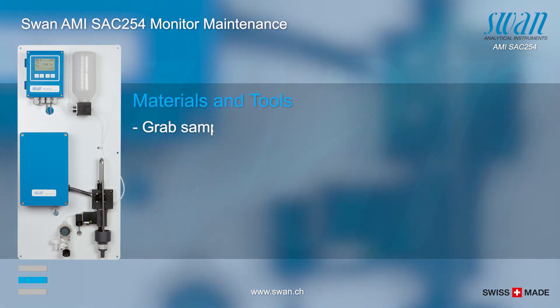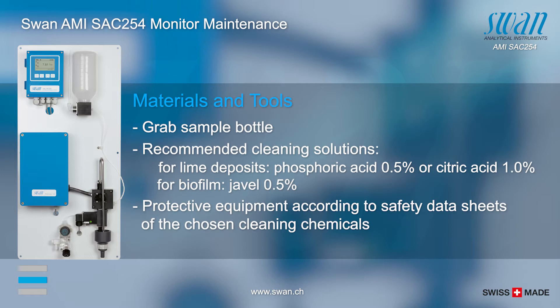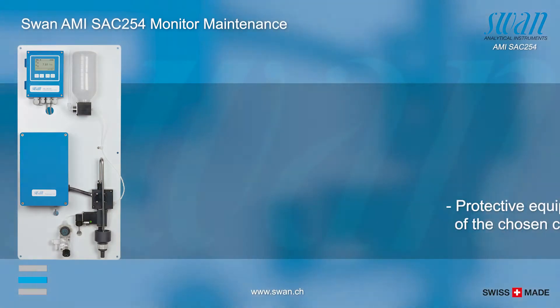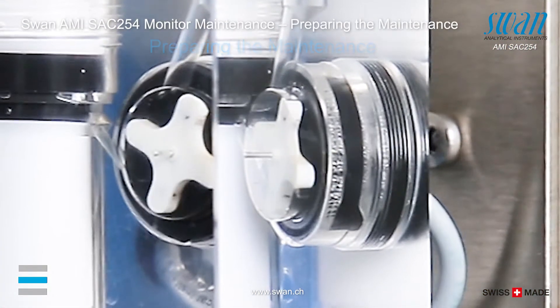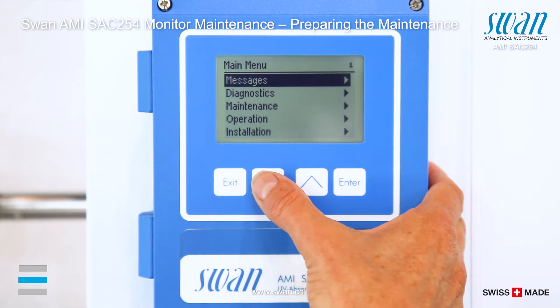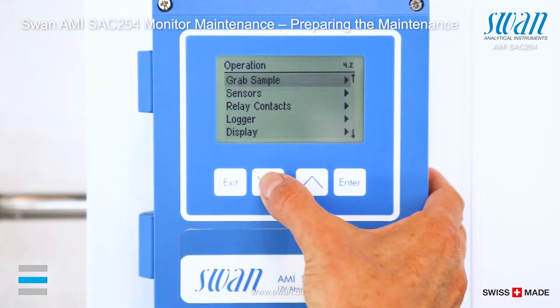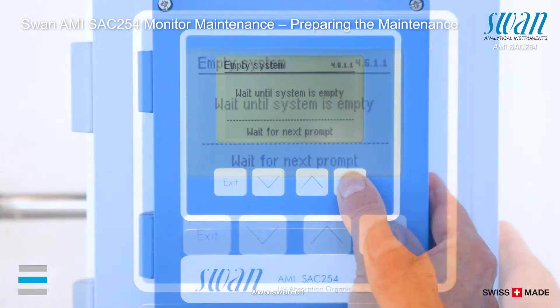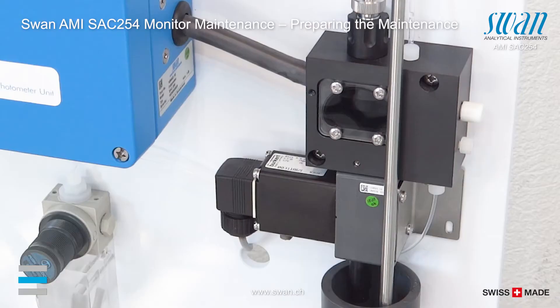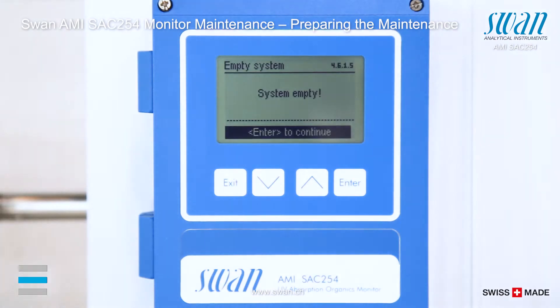The cleaning of the AMI SAC254 requires the following material. To do the general maintenance steps or to take the instrument out of operation, perform the following steps. Stop sample flow and follow the instructions. Turn off the instrument.